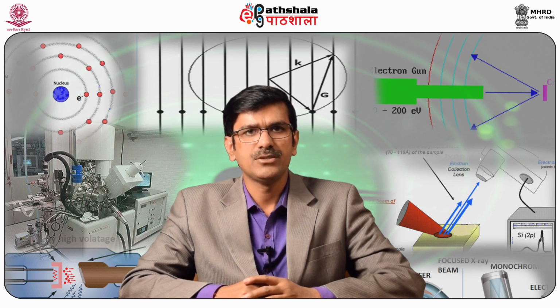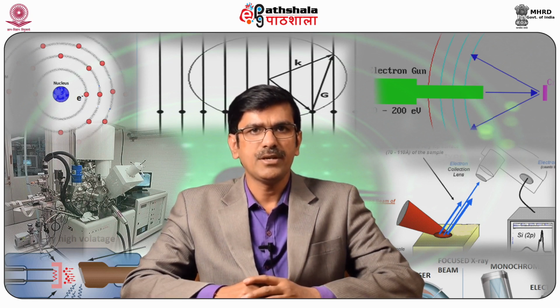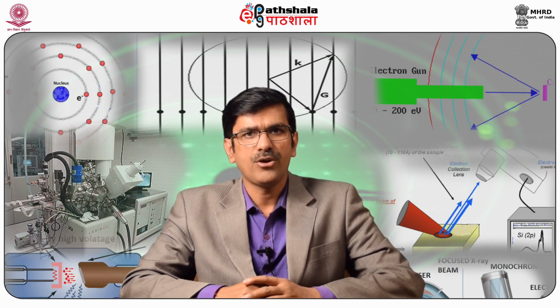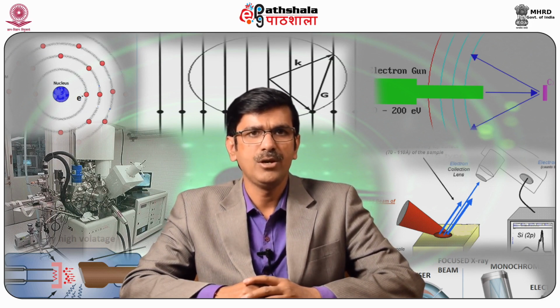Conventional XPS usually analyzes an area of several square millimeters. The typical analyzed area of high spatial resolution XPS is of the order of 100 micrometers and below.